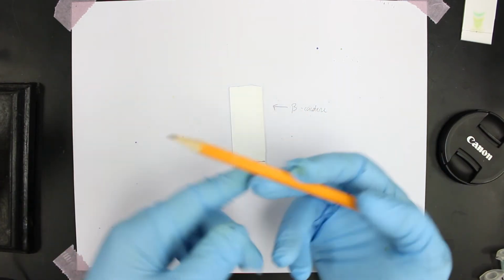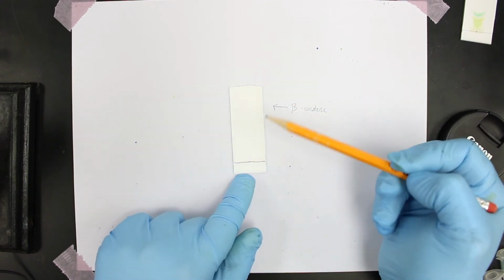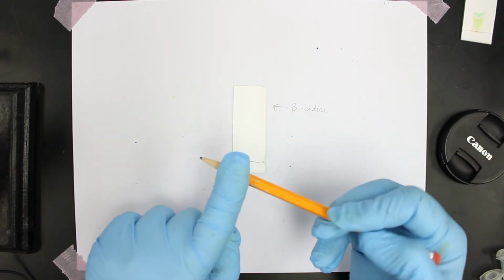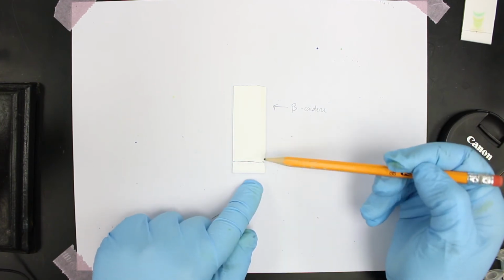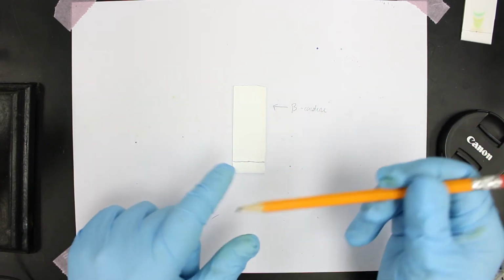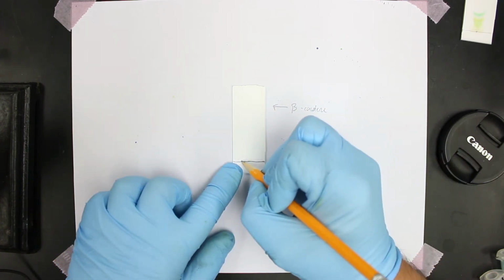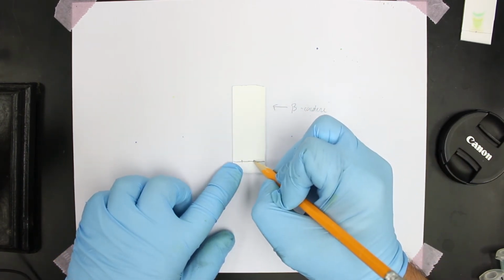Okay, and it's important that you use a pencil when you mark the TLC plate. First of all, pencils mark it very well, but if you use a pen, sometimes the ink will actually separate on the plate, so you don't want that. The graphite in the pencil is what works best. So in this example, I'm going to run two spots.